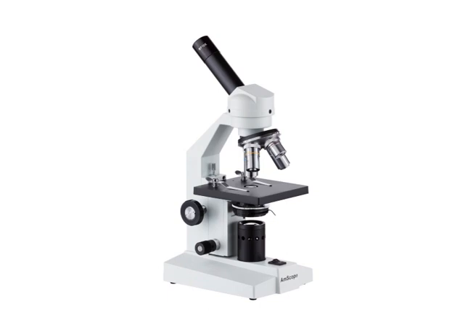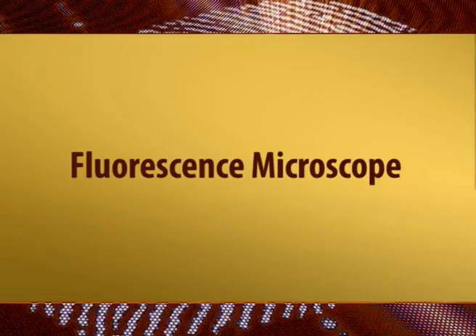In comparison with simple microscopes, the compound microscope is expensive, large and heavy because of the additional set of lenses used in the construction. The chief benefits of the additional lenses are decrease in chromatic aberration, improved numerical aperture and replaceable objective lenses for modification of magnification. This type of microscope also creates more improved illumination setups, for example, a phase contrast.